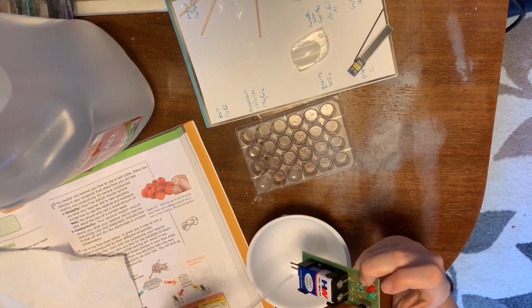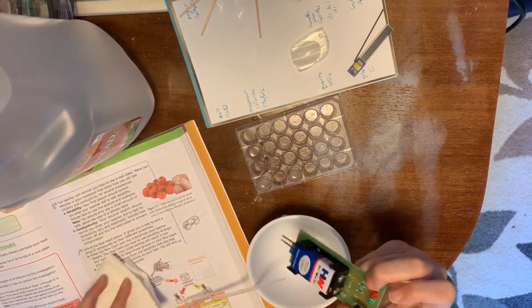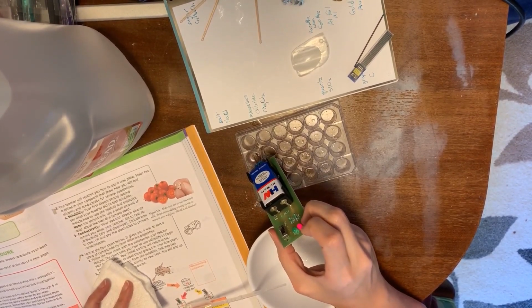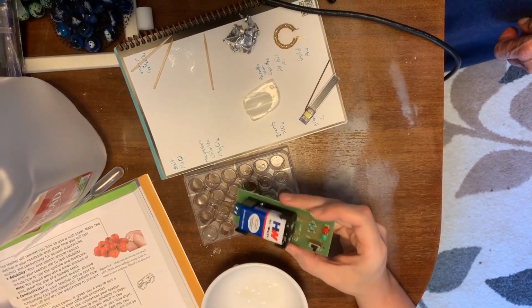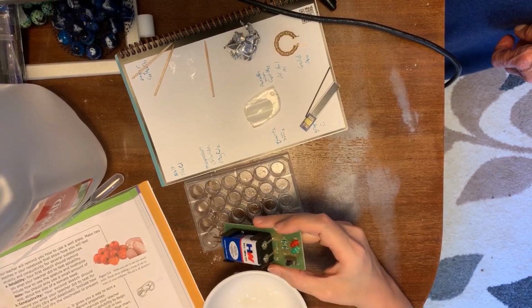So rinse it off and wipe it off. And now we're going to test it in the sugar. And so you can see you get a little bit of a light, but it's a very weak one. You may not be able to see it, but it's very weak, and just the red light is lighting up.